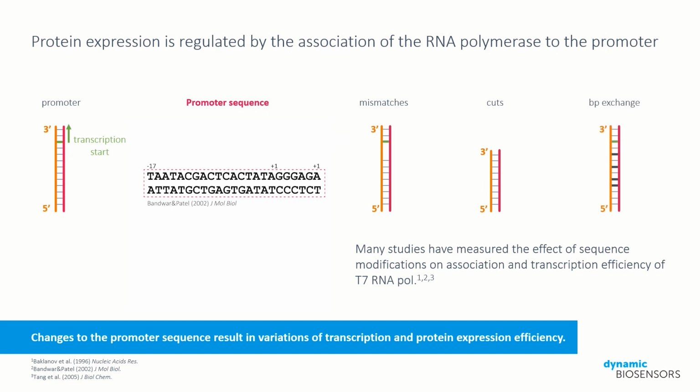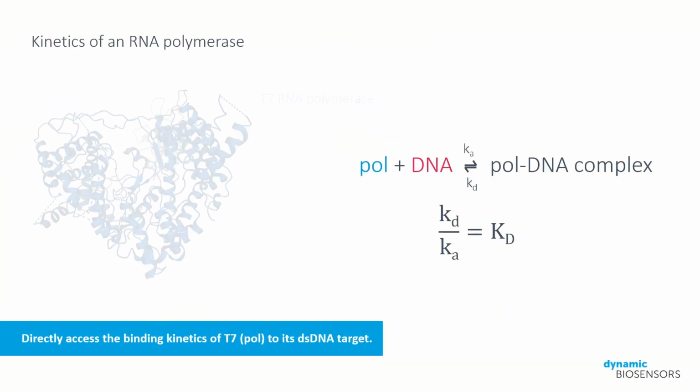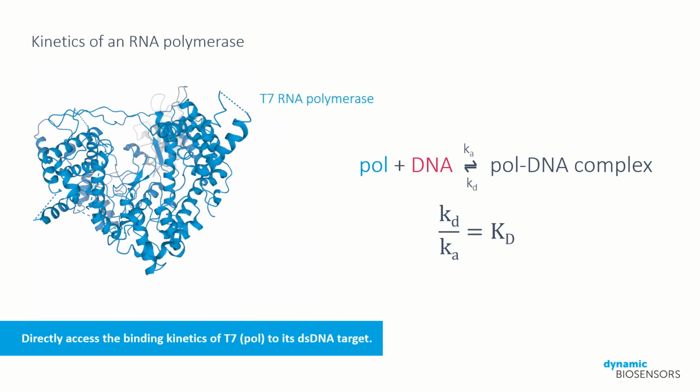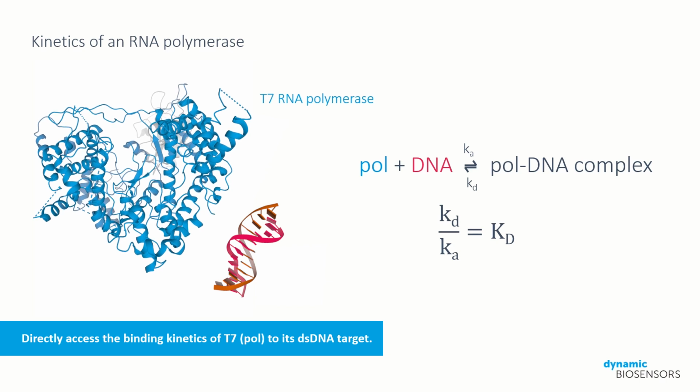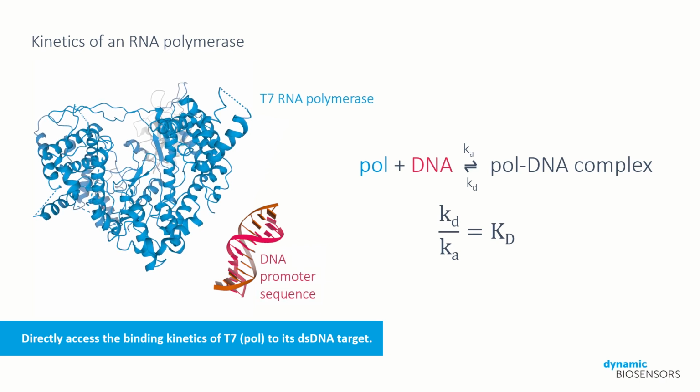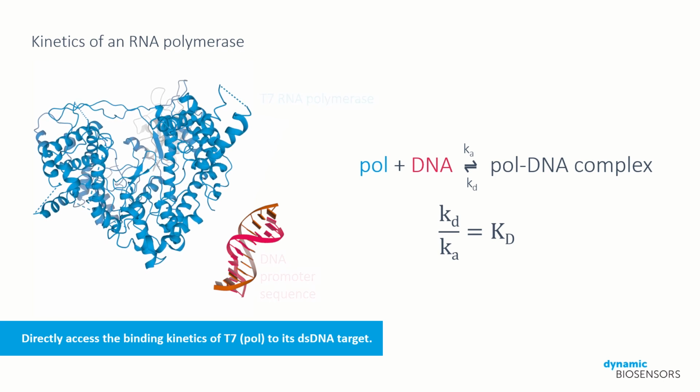However, if we think of the multi-step process required to transcribe RNA, we do not know if binding, unwinding, or any other step of transcription is affected. We need to look at the binding isolated from the downstream events to determine the effect of promoter composition on binding affinity. An increase in binding affinity may be caused by faster association or by slower dissociation of the polymerase DNA complex. To understand the underlying mechanism for a change in affinity, it is necessary to resolve the binding kinetics.